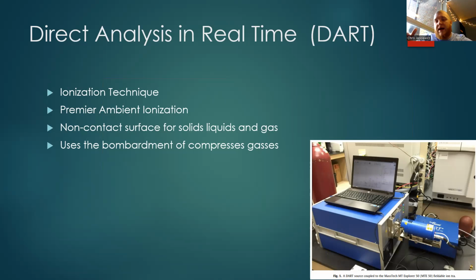The shift of mind is when we're falling into this idea that we no longer need to prepare our sample extensively before we get into our analysis, right? So it was just something that we needed to make sure that we touch upon.